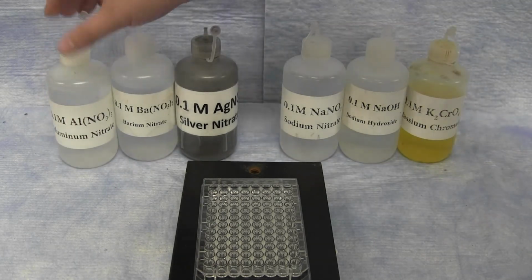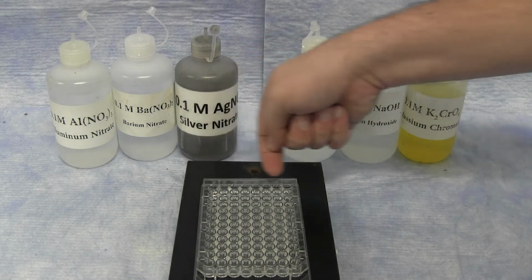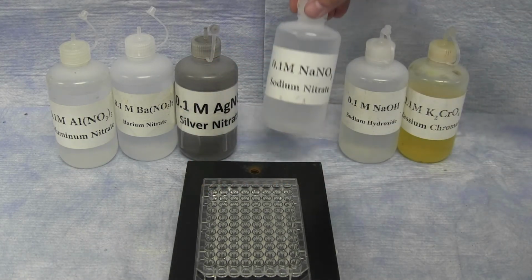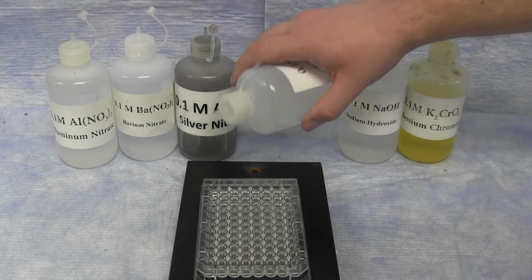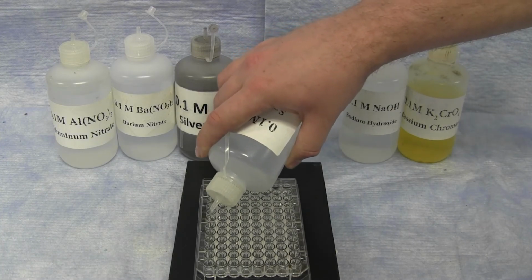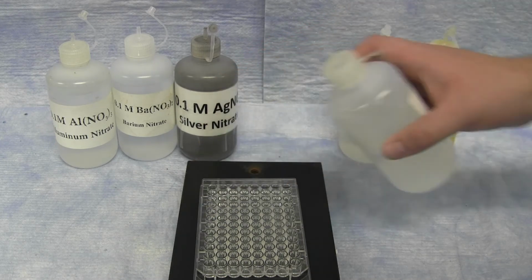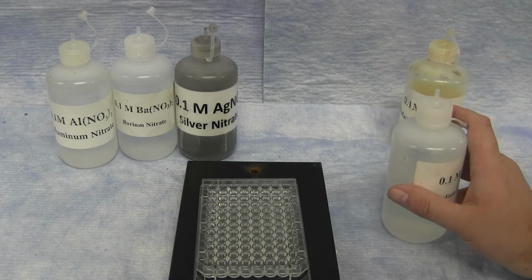Once you have all of your metal nitrate solutions across in each one of the rows, then you can start out with the different precipitating reagents, or vice versa. Again, these are now going all the way down the entire well plate. And there are 7 different precipitating agents that you're going to be using.